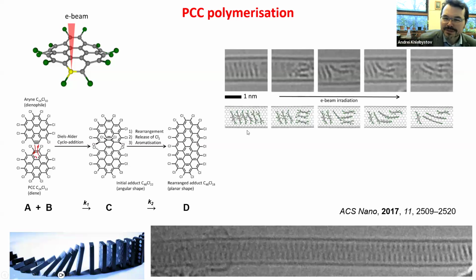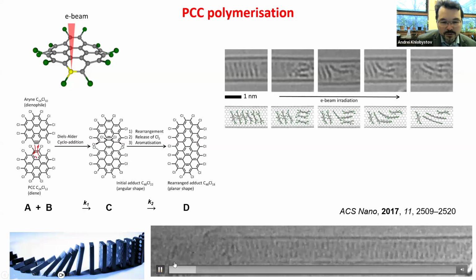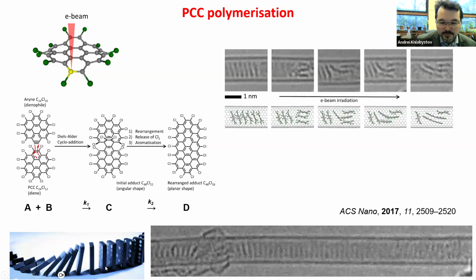Or chips, I think. I must say chips, probably. So it's a pack of the disc-like molecules in the nanotube. They come out very well in TEM. And now we can watch this reaction step by step. So watch this moving at the bottom of the slide.